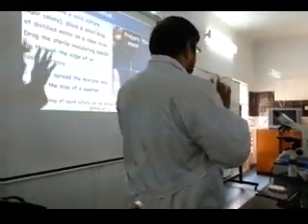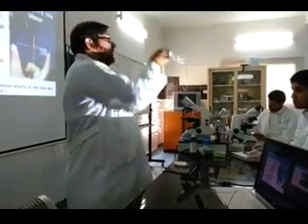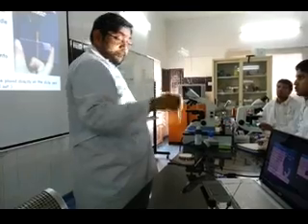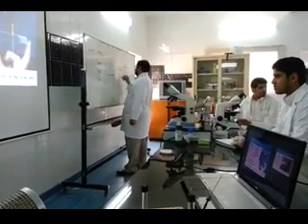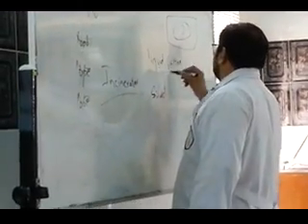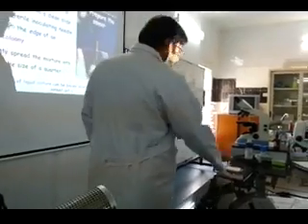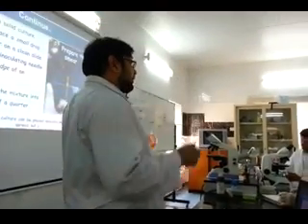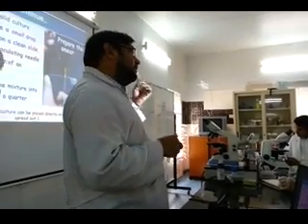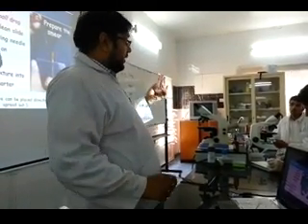Second step, there are two types of things, okay? You see this cloudy thing? This is liquid culture. Liquid. You know culture? Not heritage. It's culture, like mazra, growing. Okay? So we grow bacteria here, and we grow bacteria here. We can grow bacteria in liquid, we can grow bacteria on solid. So this is liquid culture, this is solid culture. Both of these have a large amount of bacteria inside.